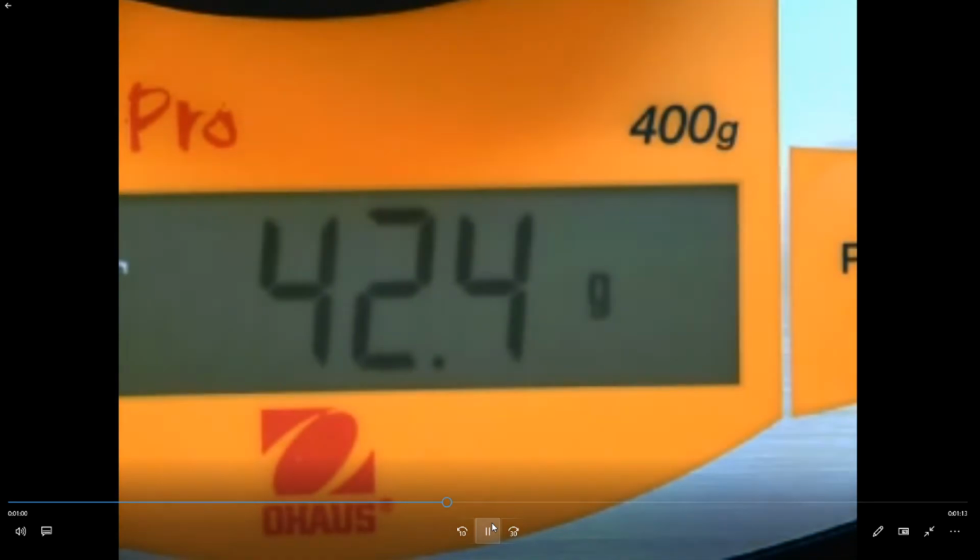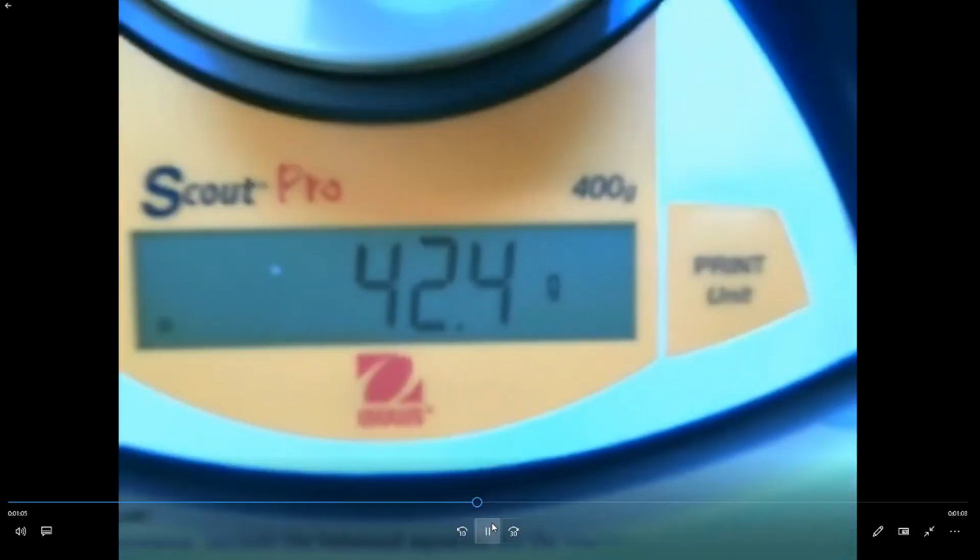So that was the acetic acid we added to the cup. And we took the reading of the mass again. Notice what's on the balance when we write this number down.